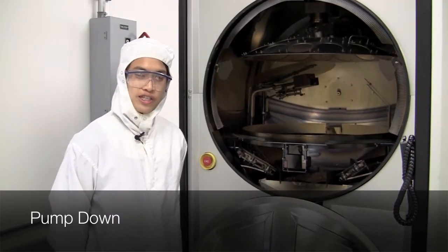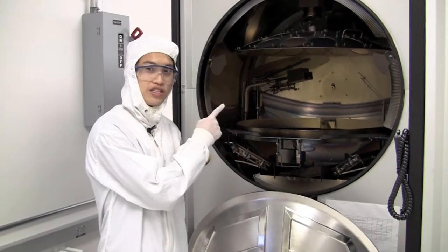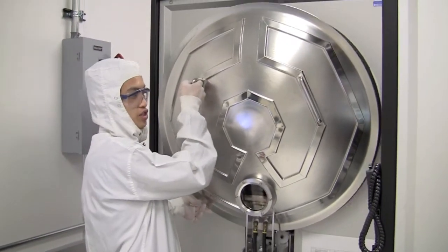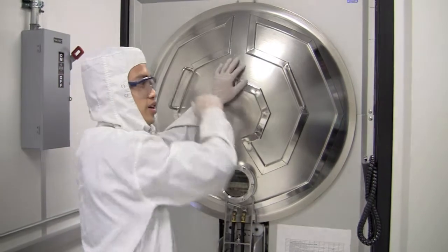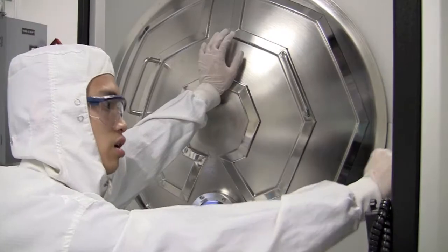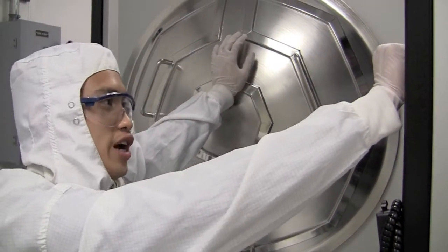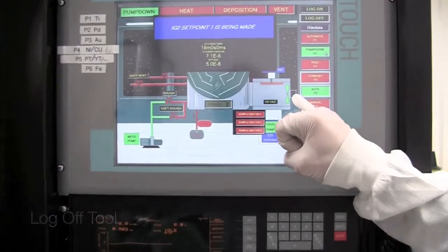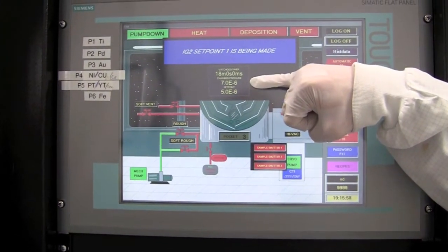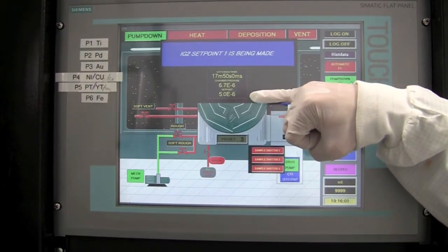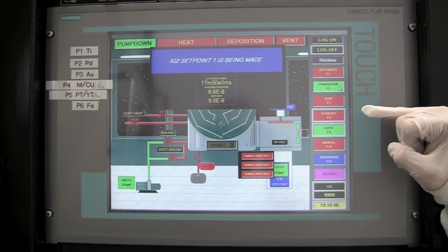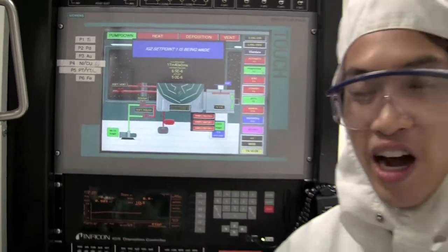To do this, we just close the chamber door and then we can push pump down to pump the chamber down. After the chamber pumps down, you want to verify that the HIVAC is once again turned on and that the chamber is pumping down to the set point. Once the pressure reaches the set point of 5 times 10 to the minus 6, you can go ahead and push standby to finish your recipe. You want to verify that you also turned off the high voltage source and that you log off the INRF computer.